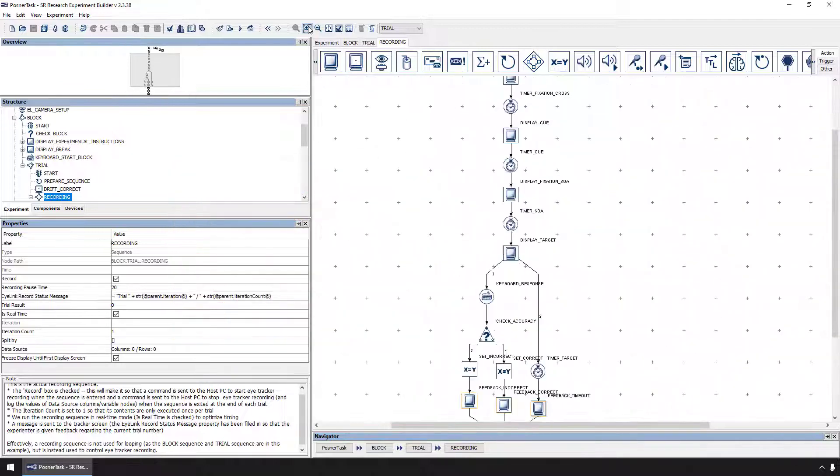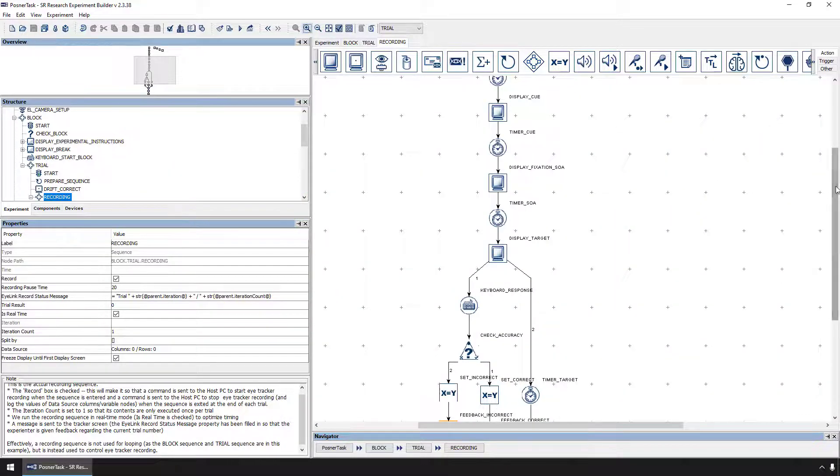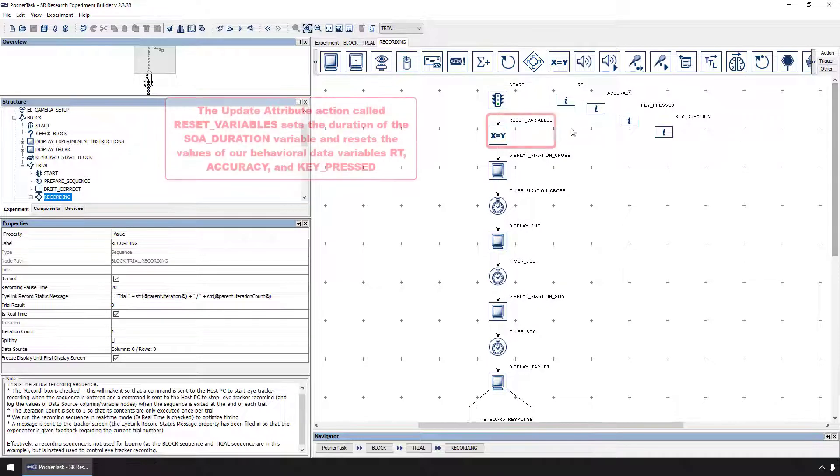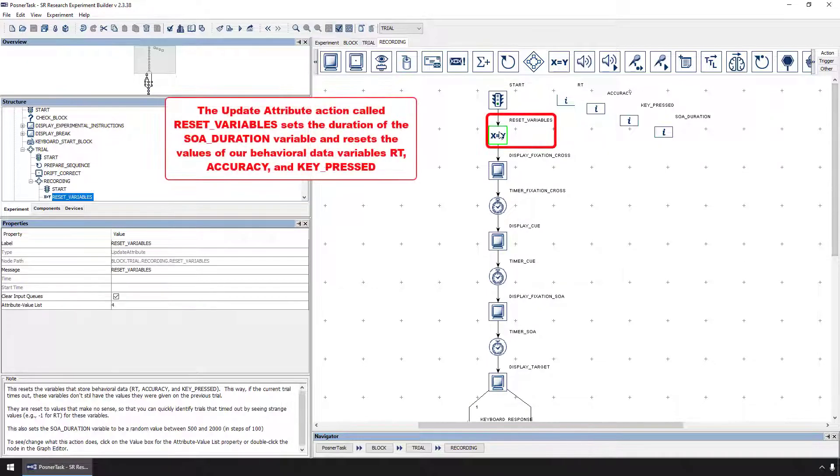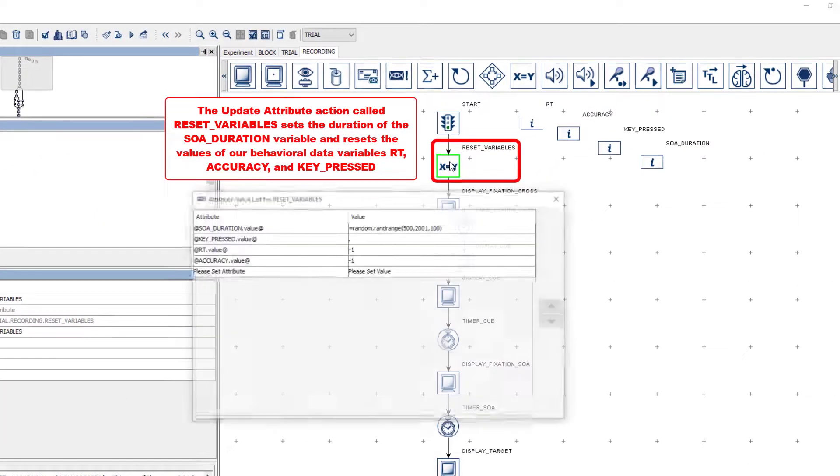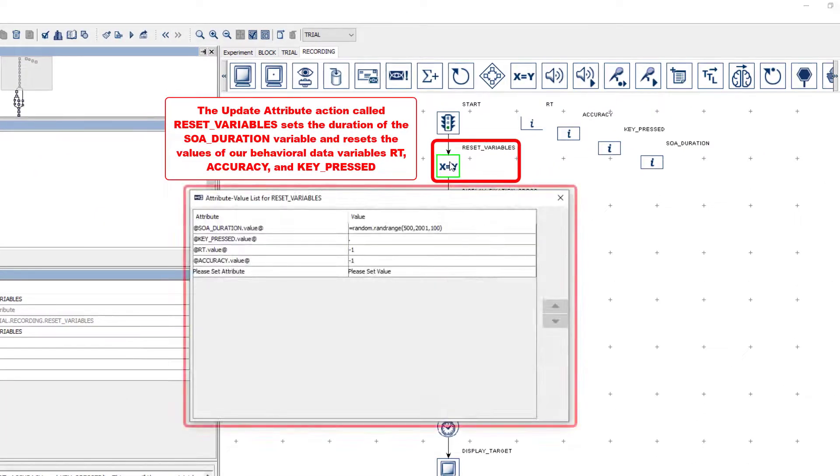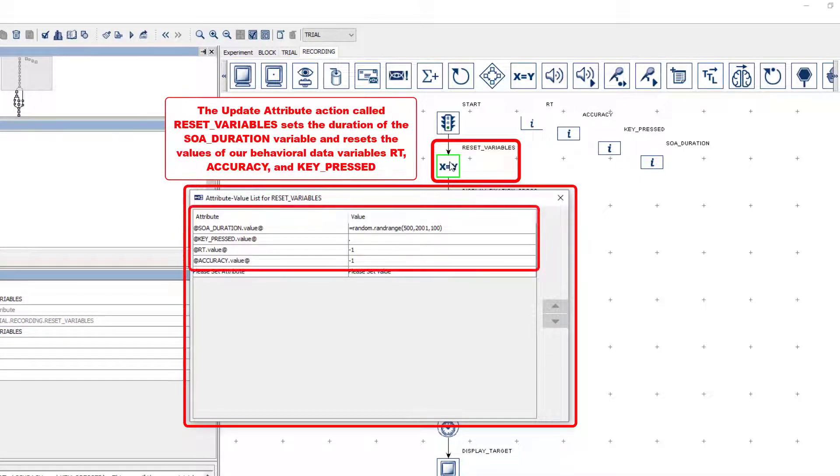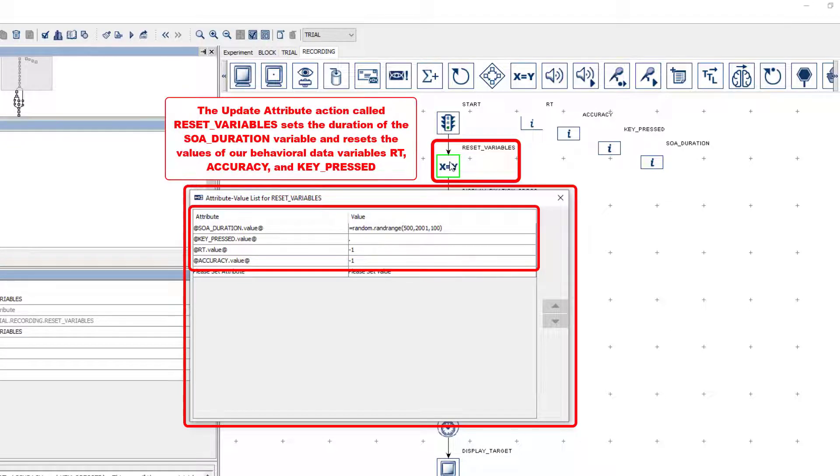The first node in the recording sequence is an update attribute action called Reset Variables. Update attribute actions, in general, can be used to edit the properties of components in the project, and one of their most common uses is to update the value property of variable nodes.